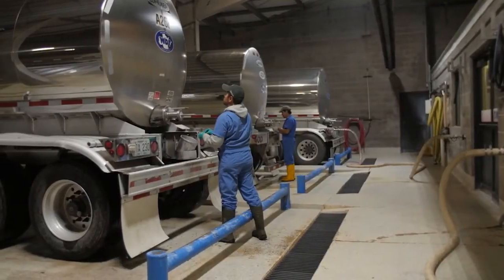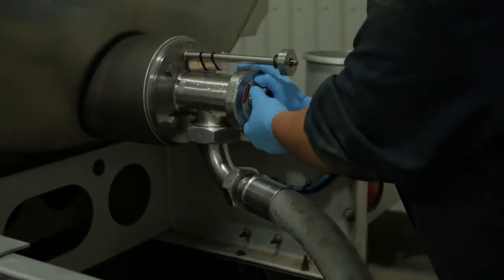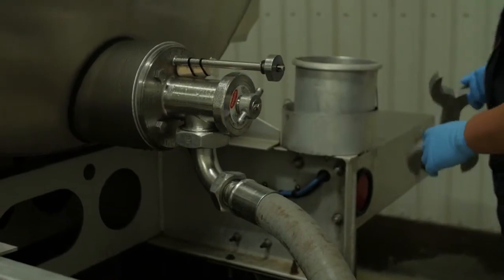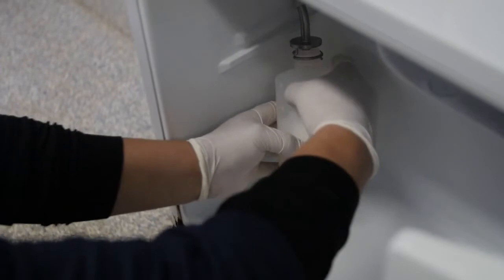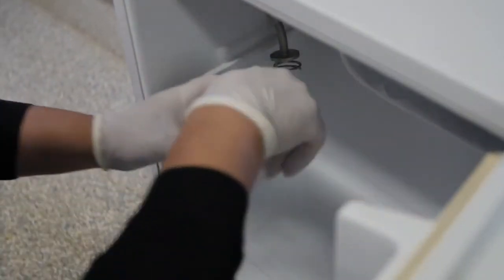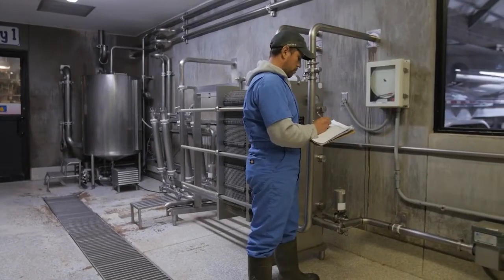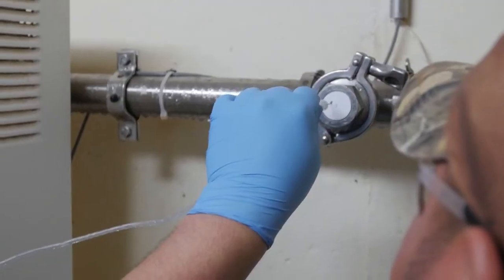The producer using an inline sampler will develop a specific protocol for their dairy, which has been approved by KDA, following FDA guidelines. This protocol is created in cooperation with the sampling equipment manufacturer, the milk buyer, the milk producer, and the FDA.